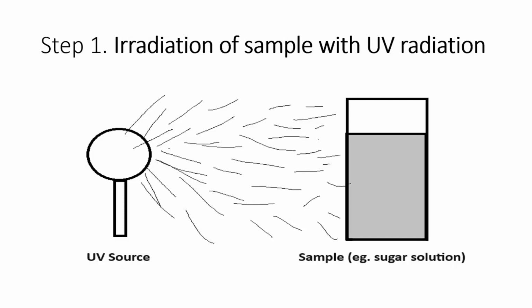Imagine you went into the lab and your supervisor hands over a particular solution to you, and he didn't tell you what the solution contains. You don't even know whether it was a sugar solution, a salt solution, or a particular chemical compound. And then he asks you to help him characterize that particular solution, starting by using UV-Vis spectroscopy.